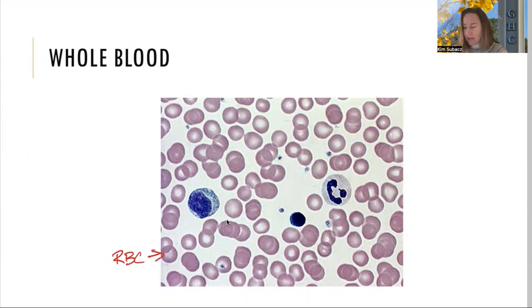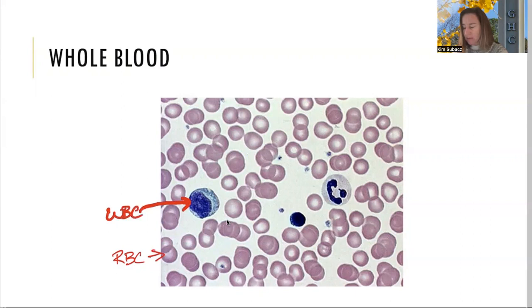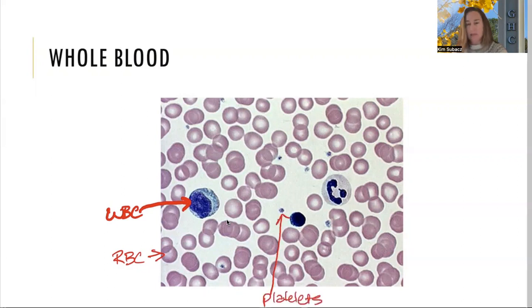The bigger bluish-stained cells are white blood cells, also called leukocytes. The little tiny guys — that one right there — are the platelets, also called thrombocytes. Those are the three formed elements we need to know.